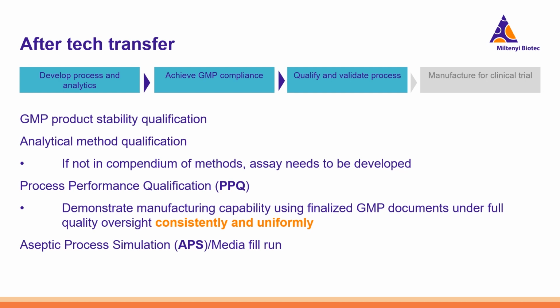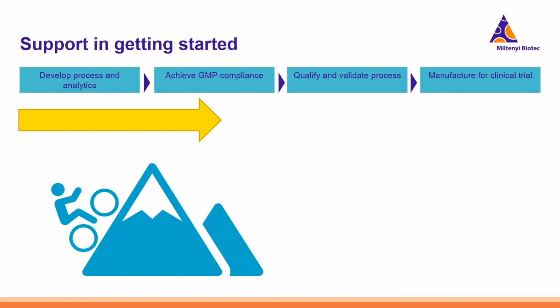Additionally, something called the aseptic process simulation needs to be run. Some people also refer to this as the media fill run, and this essentially means using mock solutions, which are in reality media for bacterial growth, in order to demonstrate the sterility of the process. I hope that I've managed to give you a little bit of a feeling of why starting pharmaceutical level manufacturing might be a daunting task for clinicians.